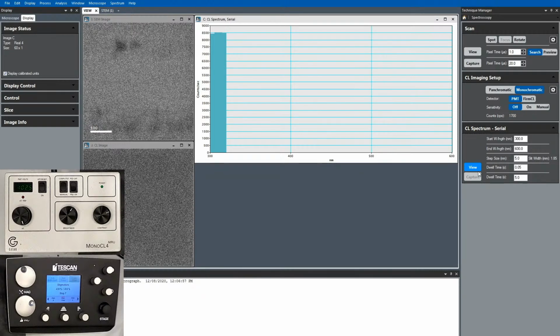So even though our dwell time is 0.05, the diffraction grating is on a motor and it's having to move. So I don't know, honestly, whether it moves and pauses and then dwells, or if it just discretely rocks throughout the whole range.